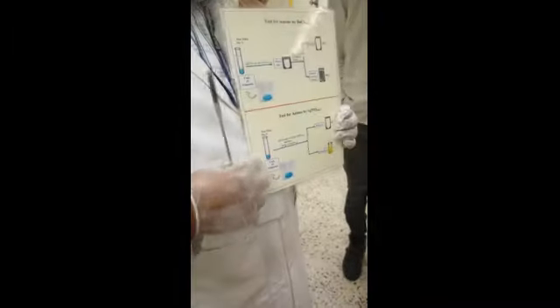Now we go to the anion table, the other side. Again the same: you have one table for anion, one test, another test. Understood? Okay, let me start with the test for anion with barium chloride. It says take 2 milliliter unknown sample to a test tube. Okay, I go to a test tube and take 2 milliliter unknown sample.